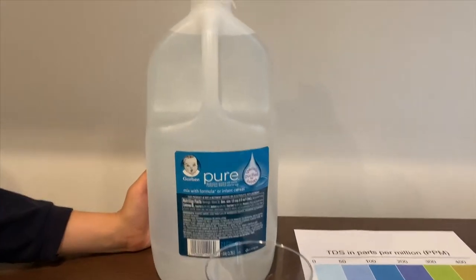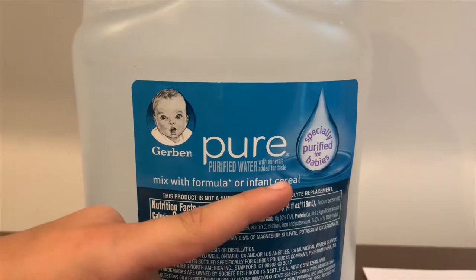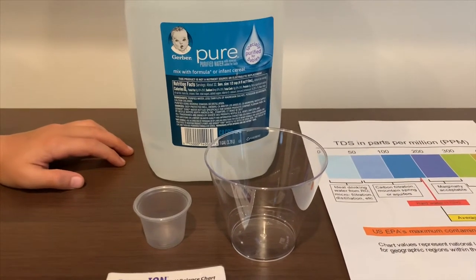This is Gerber purified water with minerals added for taste. It costs $1.49 and is sourced from wells or municipal sources in California.